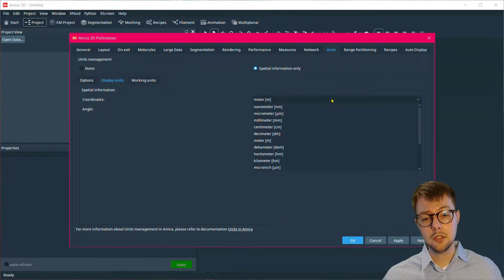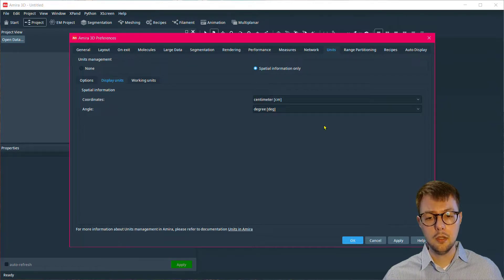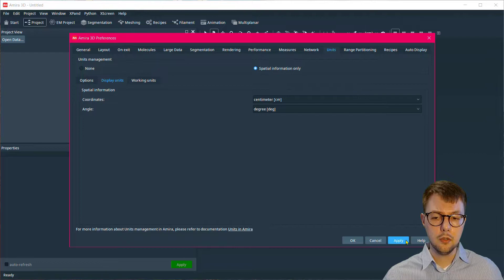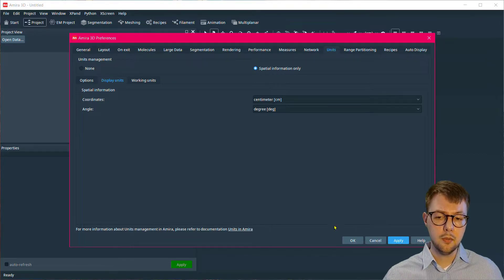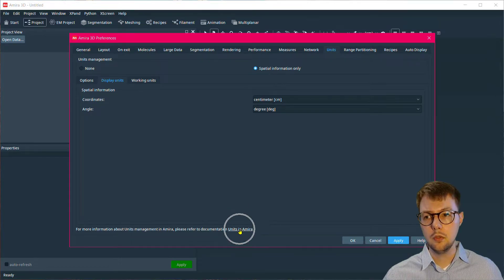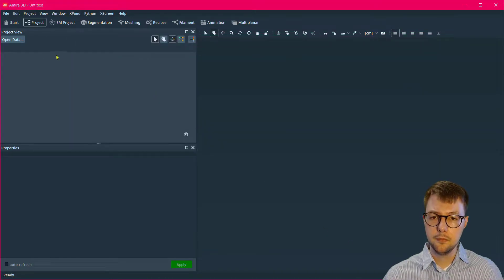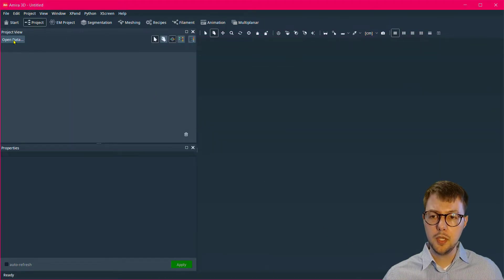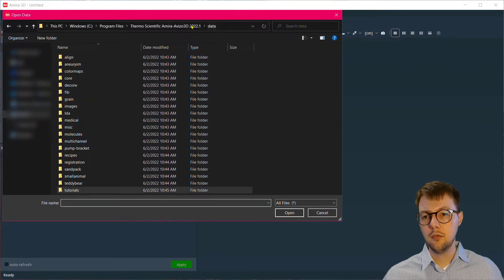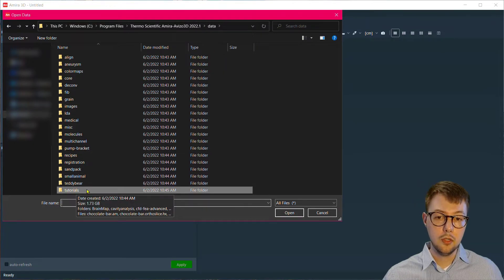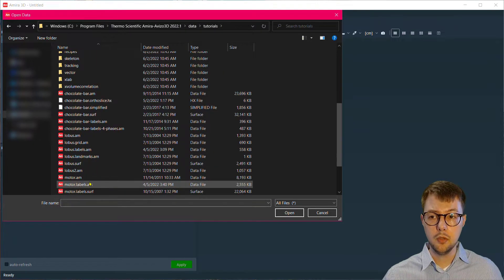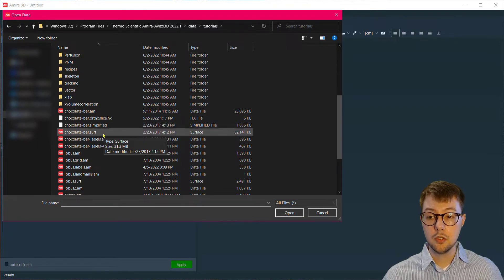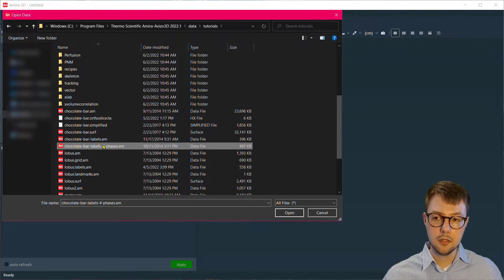After making these selections, you can click apply or OK. And if you want to learn more, you can select the units in Amira or units in Aviso hyperlink respectively. I'm going to begin with some label data that are found within the tutorial directory of the installation directory of Amira and Aviso. This chocolate bar labels four phases data set.